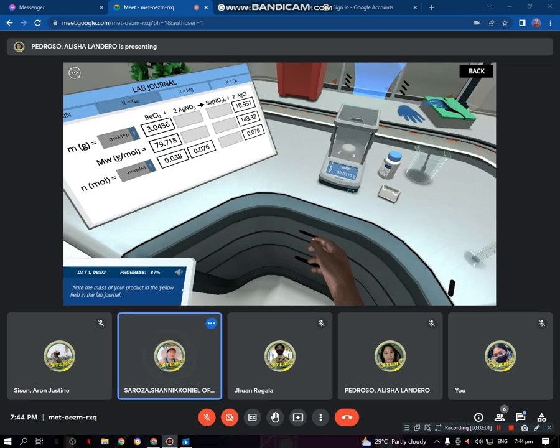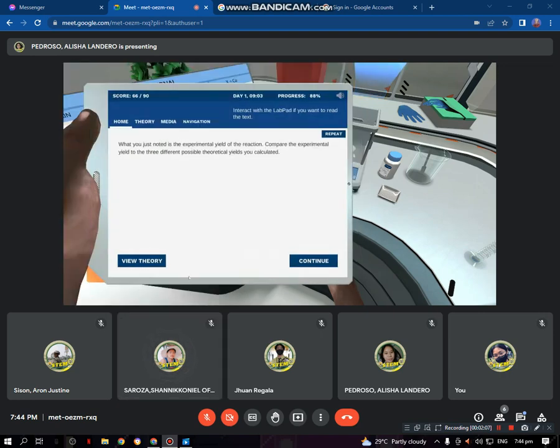All right, let's move on with the gravimetric analysis. What you just noted is the experimental yield of the reaction. Compare the experimental yield to the three different possible theoretical yields you calculated.